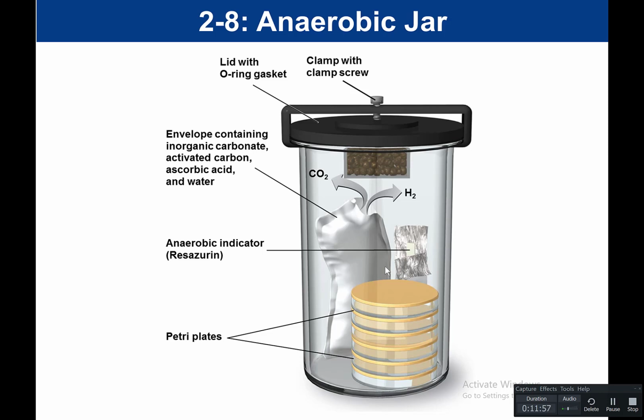And I talk about in that how organisms that live in oxygen have to have specific enzymes to be able to detoxify what we call reactive oxygen species, meaning forms of oxygen that are unstable and highly reactive. And so organisms that grow where O2 is found need to have those enzymes to basically neutralize those reactive oxygen species, to make it so that they're not toxic to the bacteria.